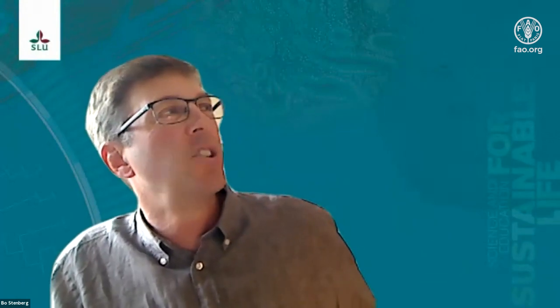I think another interesting question from what I could see so far is that most of the colleagues in the audience are interested in how this technology can facilitate fertilizer recommendation. I don't know if you have any experience, or we can hear some of you about the perspective. Yeah, that's kind of how we want to use it, but it's not direct because, as I just said, the plant available nutrients generally don't absorb.